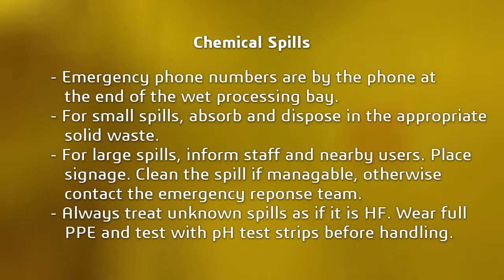If after hours, contact the emergency response team. For unknown spills, always treat as if it's hydrofluoric acid. Wear full PPE and test with the pH test strips.